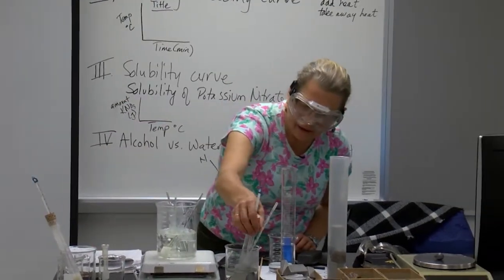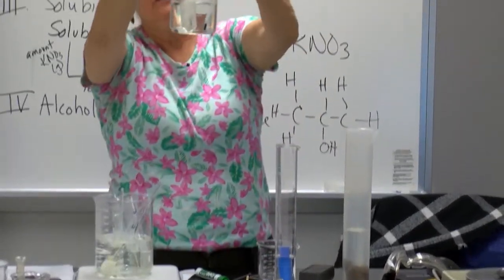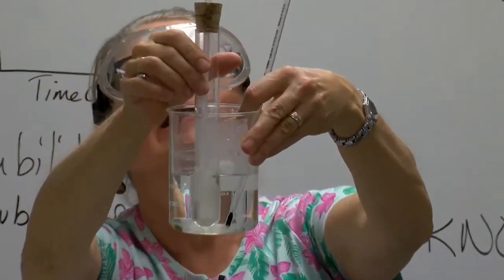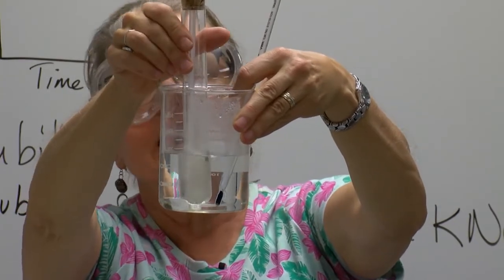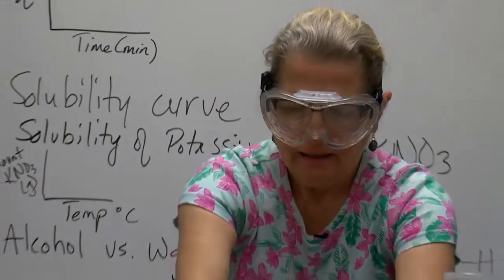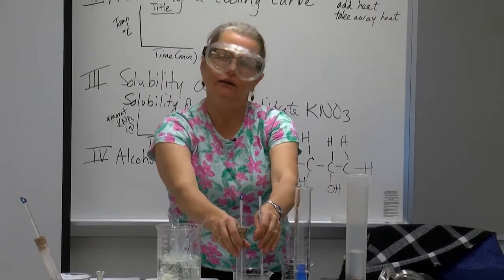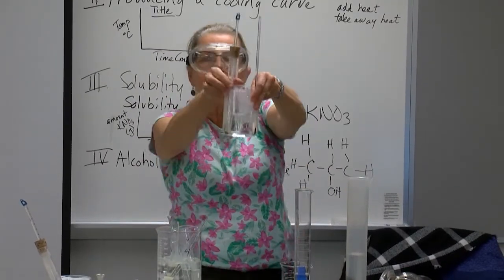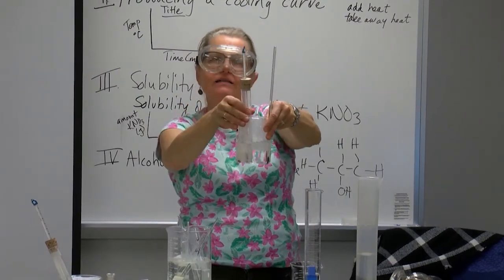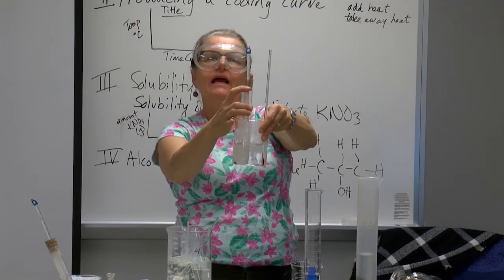Now we're looking at our cooling curve. Whoa, look at this. We see now that this has started to form back into solid, and it's right around 68 degrees. So the stearic acid is at 68 degrees. The water is all the way down to 60. They're in the same container. The water is 60 degrees, but the stearic acid is stuck at 68 degrees.